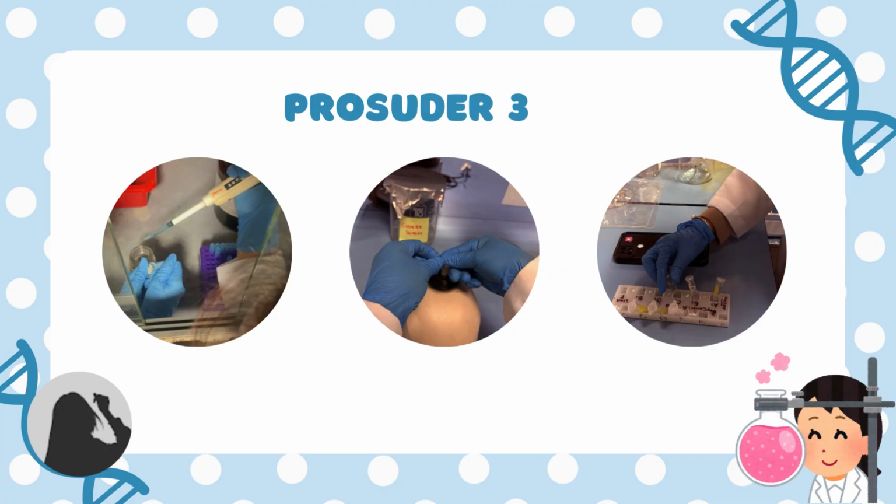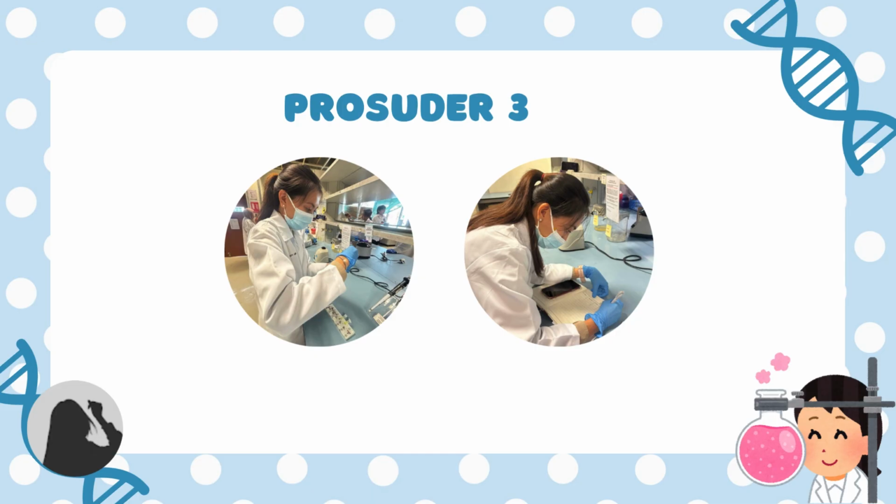Once capped, gently shake each tube for 5 to 10 seconds, then mix the contents thoroughly using a vortex mixer. Then observe what happens after shaking. Lastly, after mixing the contents using a vortex mixer, we make observations on the lipid solutions about the appearance, color, odors, and the solubilities in water and toluene. After we complete all the solubility tests, we record and observe the results in the data tables.